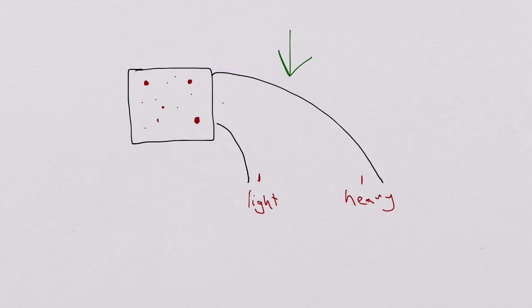And really all you have to do in principle is count how many particles crashed here, count how many particles crashed over here, and if your instrument is calibrated, you could tell exactly how many light particles you had in your sample, and you can tell exactly how many heavy particles you had in your sample. And so that way you can measure the relative abundance of heavy and light isotopes in your sample, and also specifically based on where they land on this trajectory line here, you can tell exactly how massive they are relative to the charge that they had.